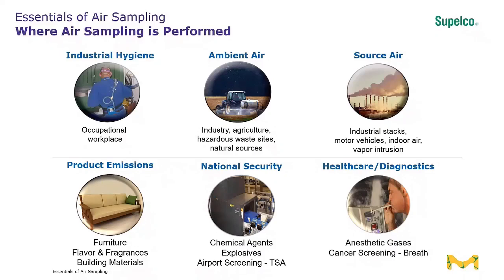also in healthcare for anesthetic gases, for cancer screening in some applications, also in national security. So it's important to understand where you're taking the air sample, what those concentrations are in those environments, and which devices are most suitable for those environments.